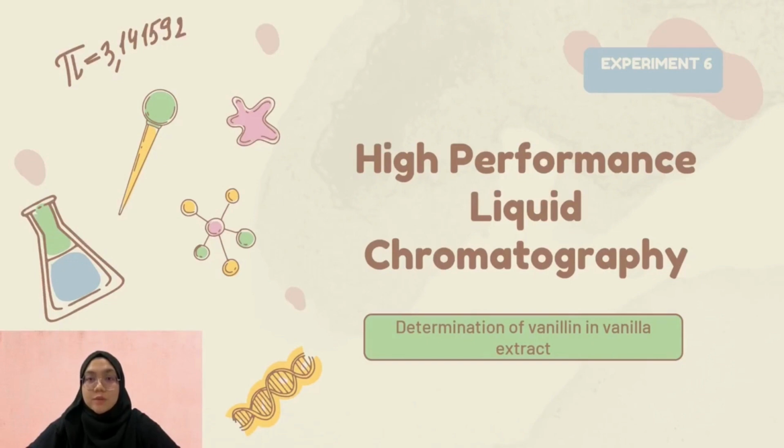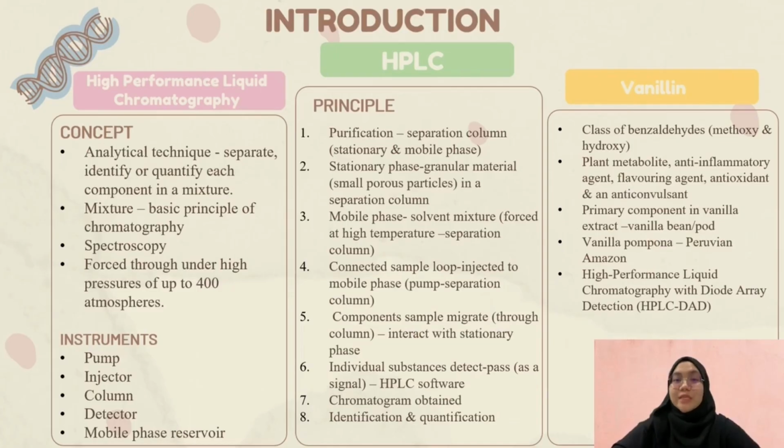Assalamualaikum warahmatullahi wabarakatuh. My name is Aisha Zulaika, and my group and I will proceed with experiment 6, which is high-performance liquid chromatography for the experiment of determination of vanillin from the vanilla extract. I will start with the introduction.